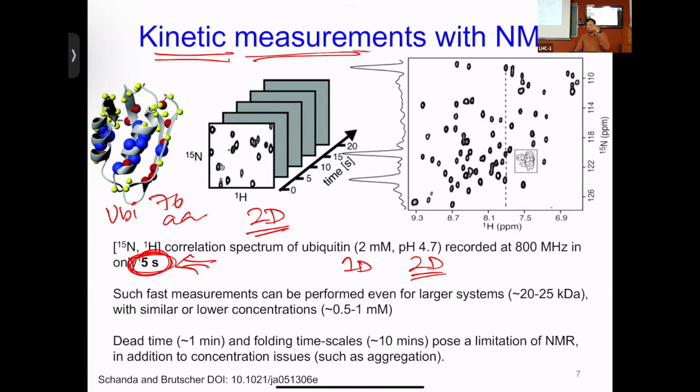So they take the protein in H2O, they added a lot of D2O to it. What is going to happen? The NH, when you add D2O, will become ND. It should become ND. The moment NH becomes an ND, the resonance gets absent from the two-dimensional nitrogen proton experiment. So what they did is to take it, run the two-dimensional nitrogen proton without much deuterium, and then they added a lot of deuterium, D2O, into it, and then saw this exchange.